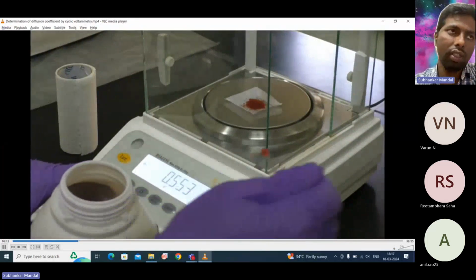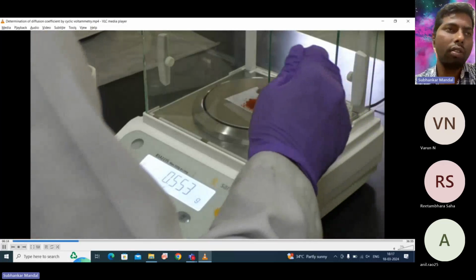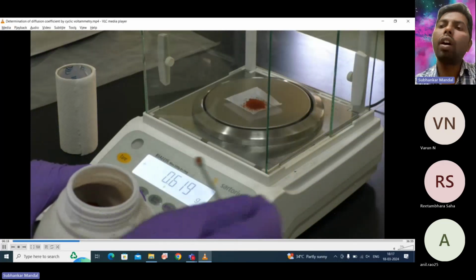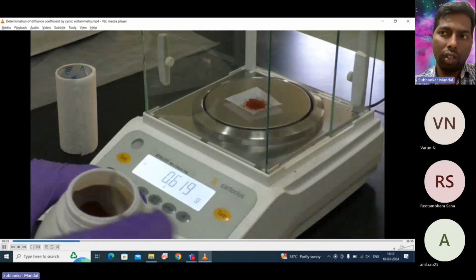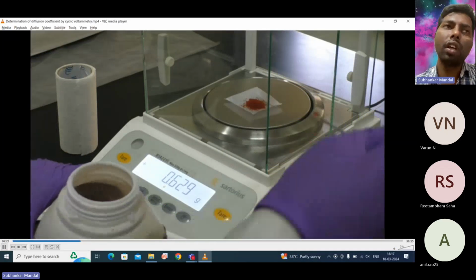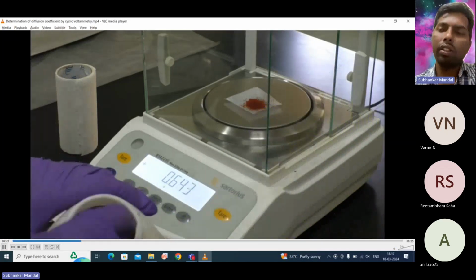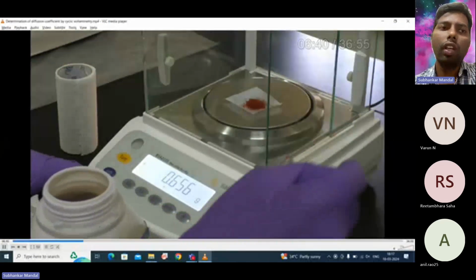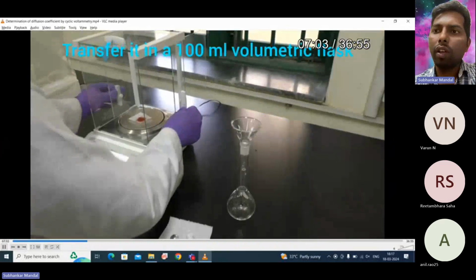All these things we will see in this video. And I think how the potentiostat looks, how to use the potentiostat, and how to measure the open circuit potential. All these things we'll see in this video. Okay, so I can go a little bit fast.